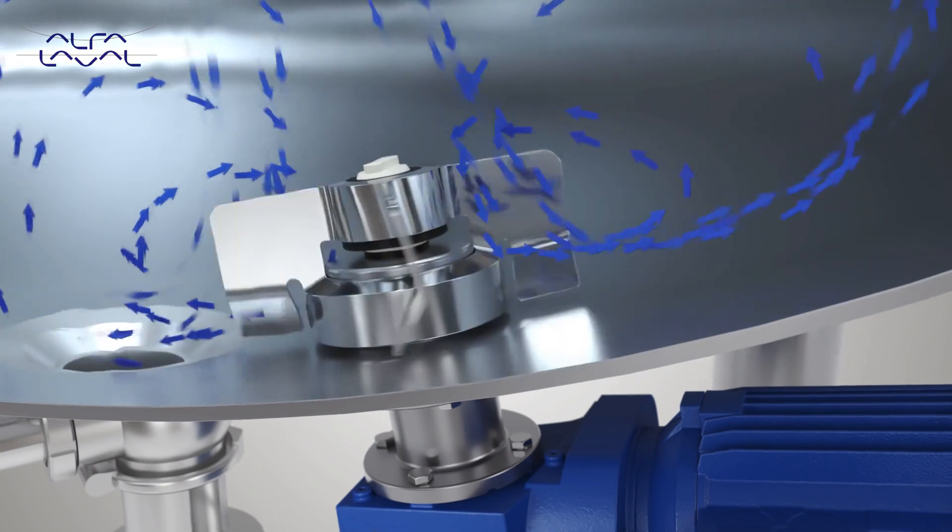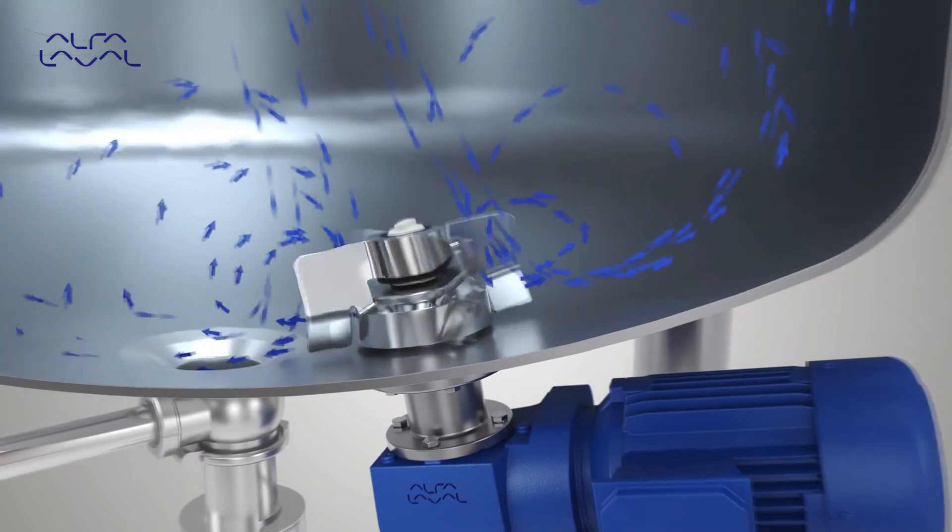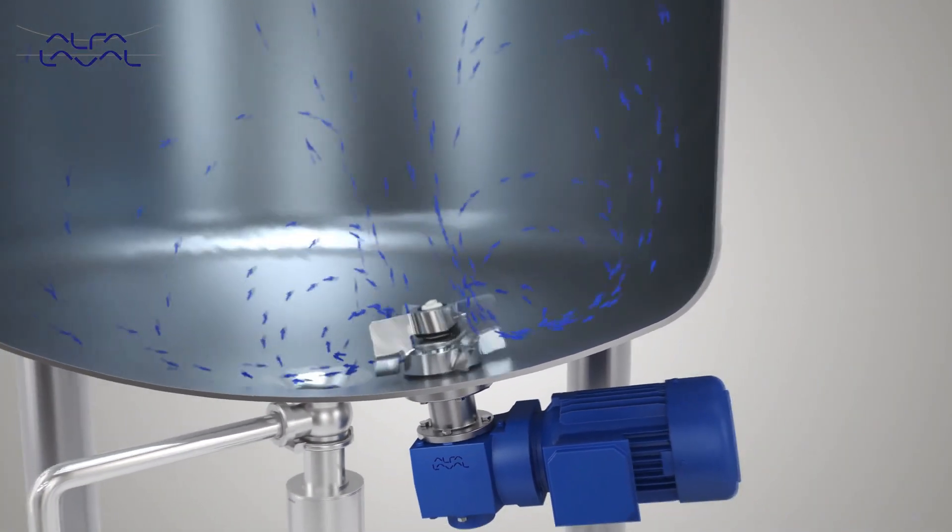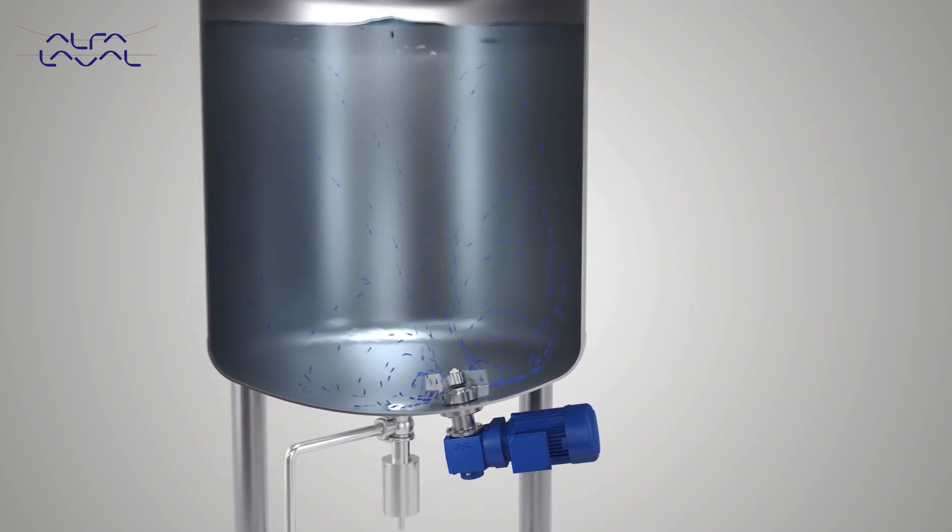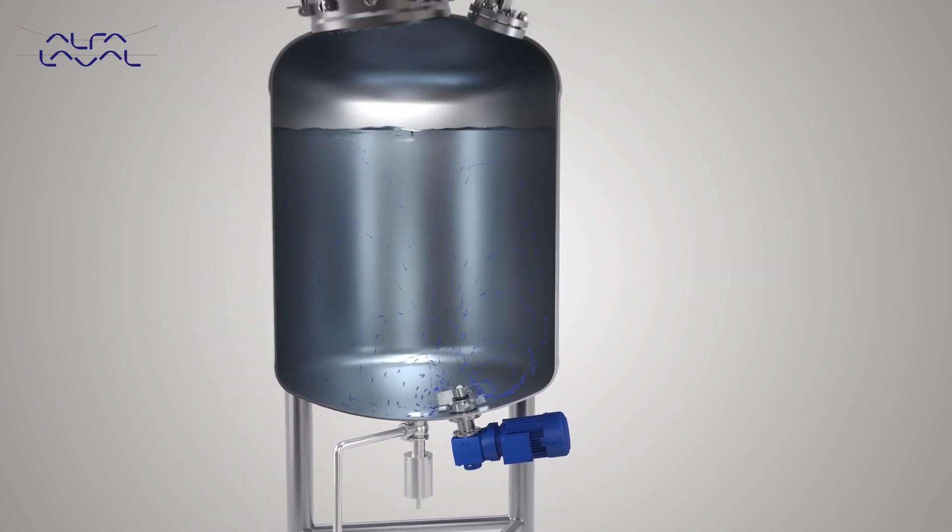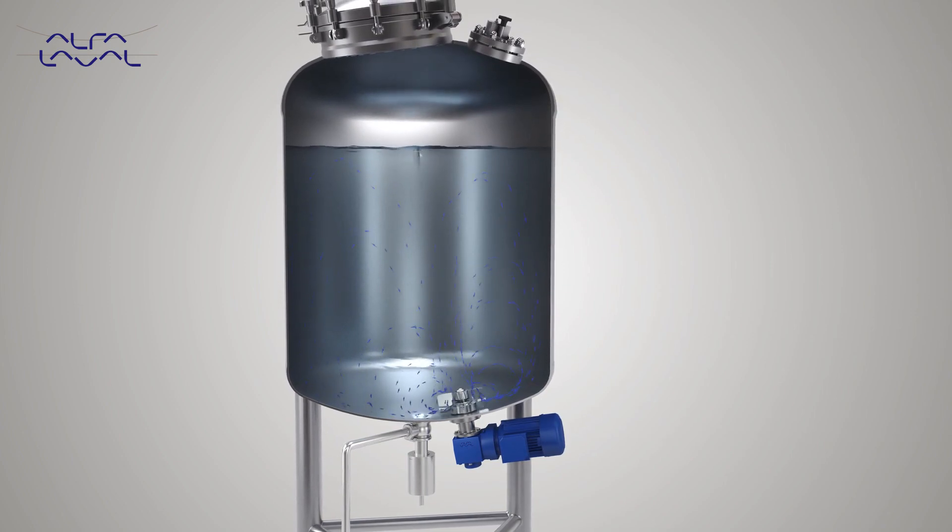The impeller unit design optimizes the flow, promoting gentle product handling, higher efficiency, and less energy consumption.